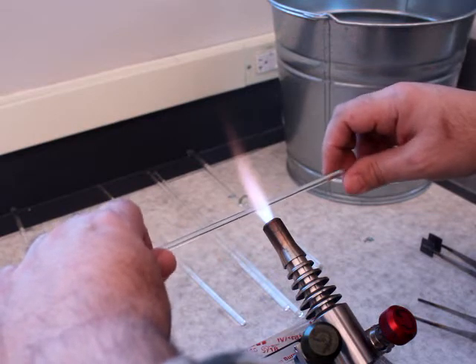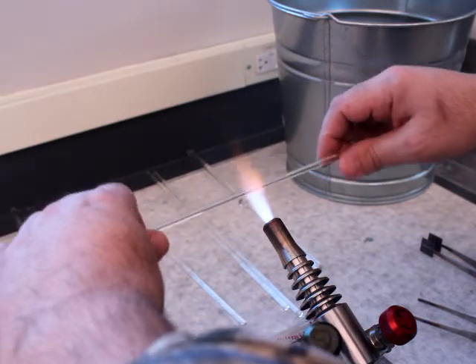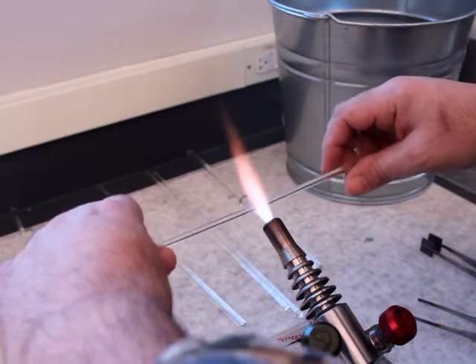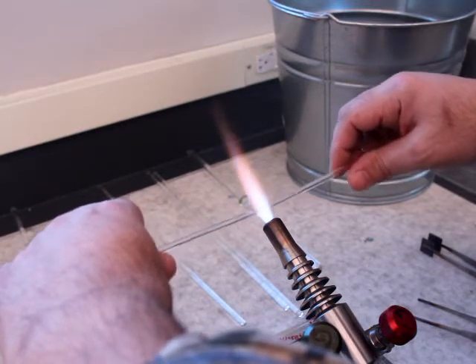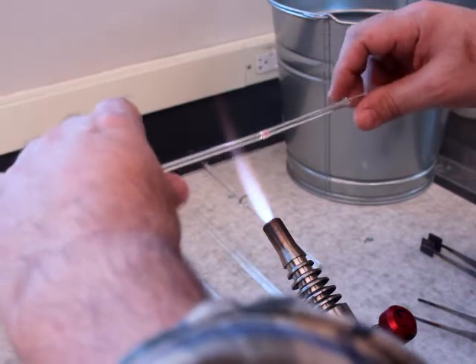I bring the 5mm glass down into the flame. I can see it start to soften. I'm going to pull back a little bit to slow that process down — just because it's 5mm, it's going pretty quick. I dip below the flame, I keep rotating.